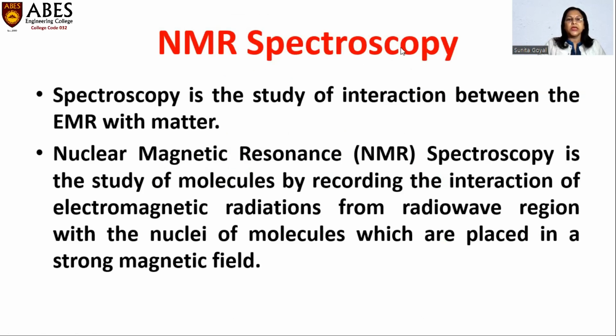So, what is NMR spectroscopy? Till now, we might have learned about the term spectroscopy. Spectroscopy is the study of interaction between electromagnetic radiation and matter. Here, we are particularly concerned with molecules whose chemical structures are to be determined.